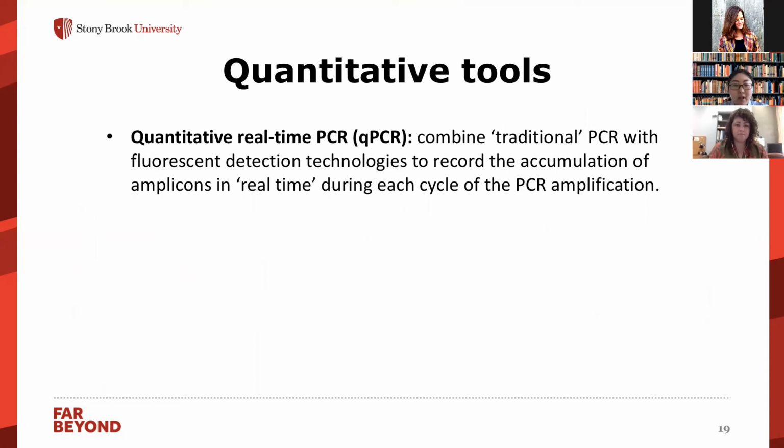Quantitative real-time PCR, also called real-time PCR or qPCR, is a PCR-based technique that can amplify and also quantify the target DNA in real time. qPCR has been widely used in environmental microbial studies as a tool for detecting and quantifying microorganisms of interest. It can help us to have better understandings of the complexity of wastewater microbial communities. Despite the important role that microorganisms play in nitrogen removal, few studies have investigated the nitrifying and denitrifying microbial communities in on-site wastewater treatment systems by qPCR.